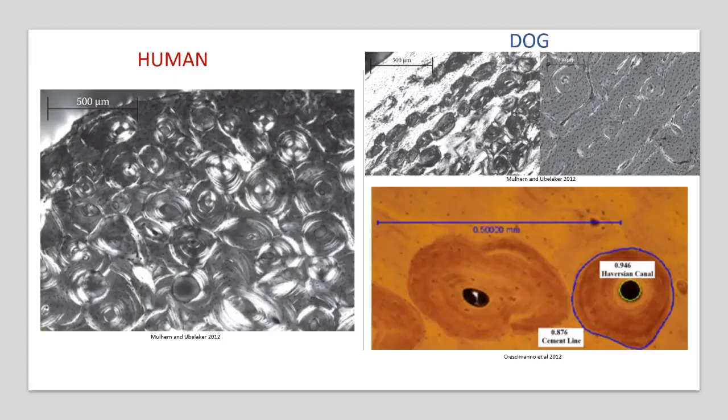side. In the third case, on the left, there is a sample of human bone and on the right of a dog bone. The latter has osteons linearly arranged with osteon banding. The difference between the organization and the size of the osteons is clearly seen.